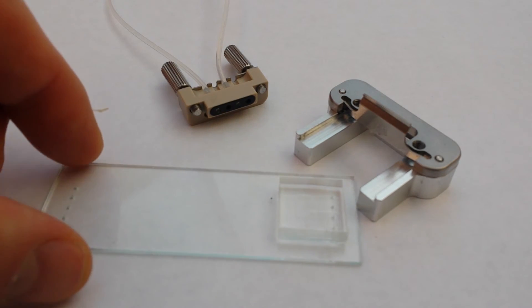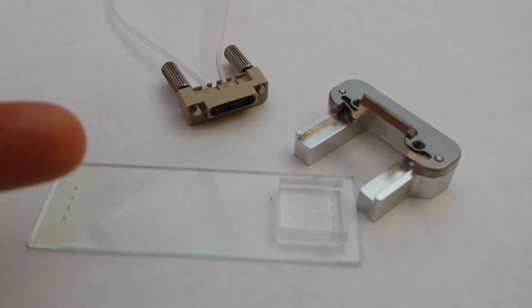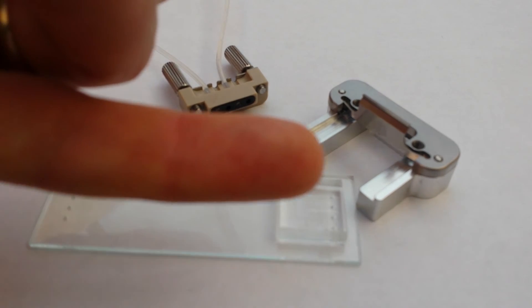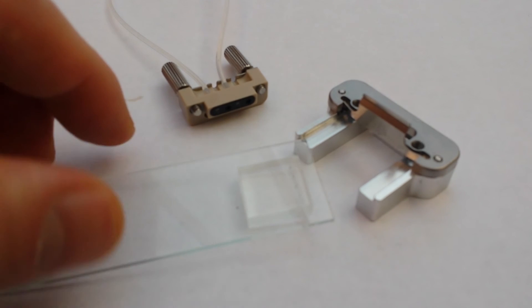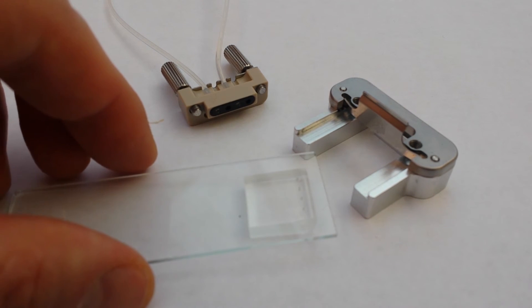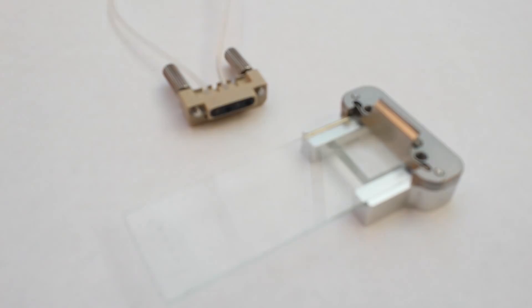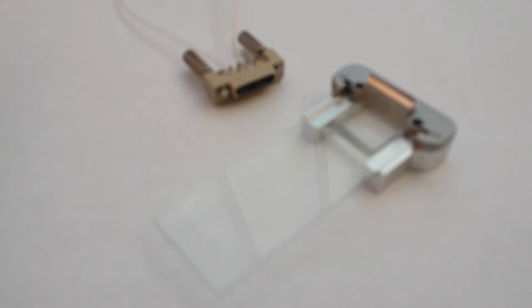Let me show you how this actually works. The PDMS has been bonded to the glass slide, following the design rules so that the holes on the PDMS are lined up with holes on the glass slide. When you turn it around, you have a hard surface against which you can bond. I'm going to slide this into this — and it slides in there. You can imagine the amount of engineering that's gone into a part like this; it's not trivial.